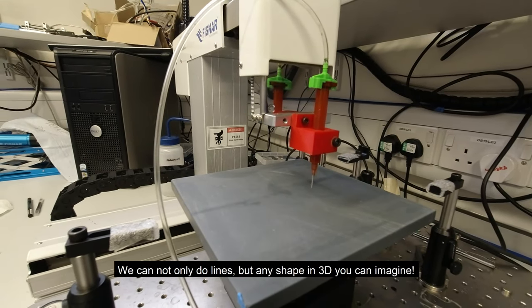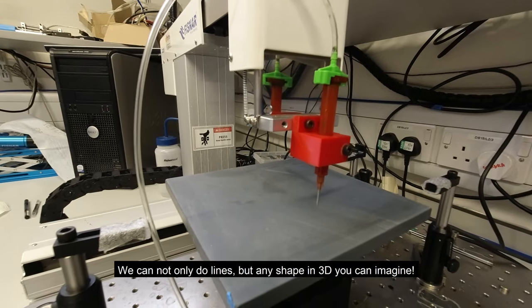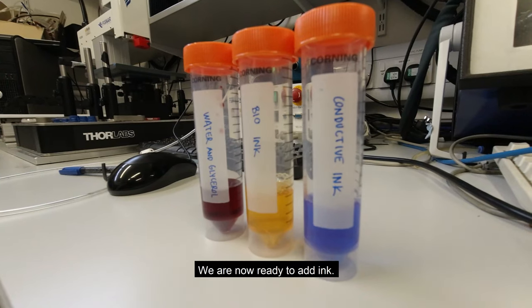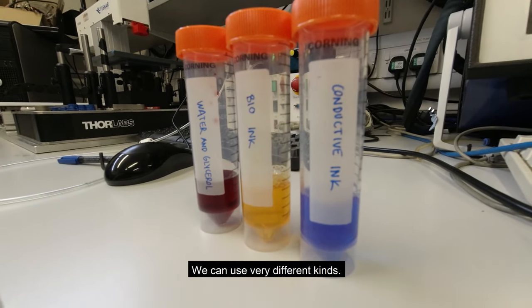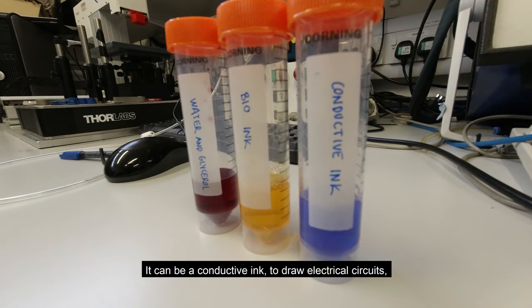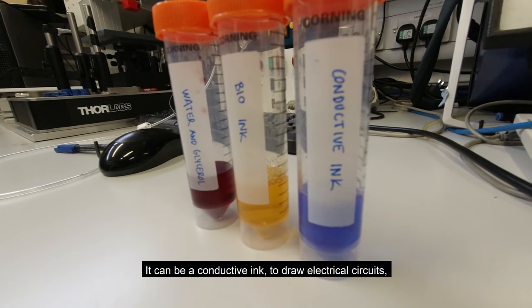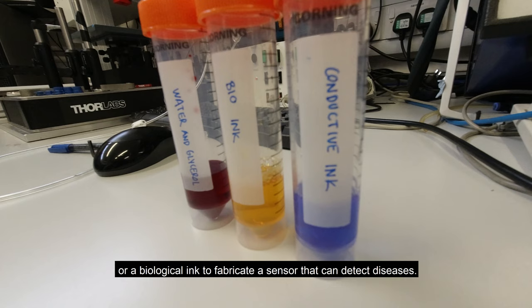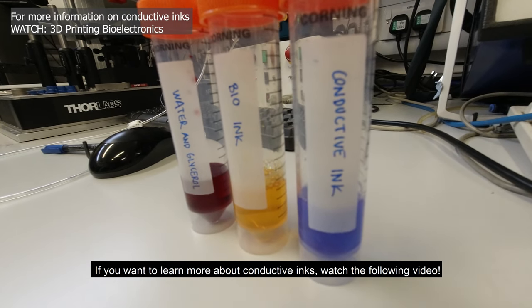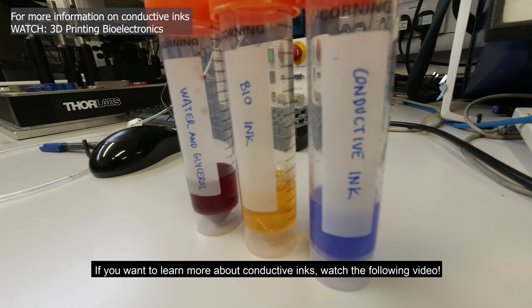We can not only do lines, but any shape in 3D you can imagine. We are now ready to add an ink. We can use very different kinds. It can be a conductive ink to draw electrical circuits, or a biological ink to fabricate sensors that detect diseases. If you want to learn more about conductive inks, watch the following video.